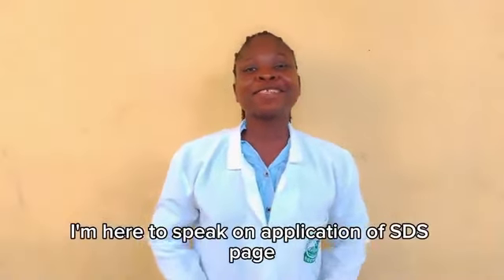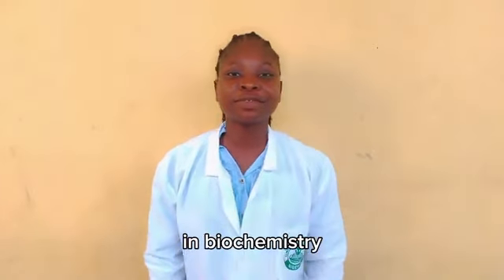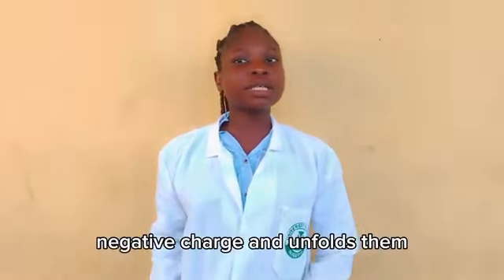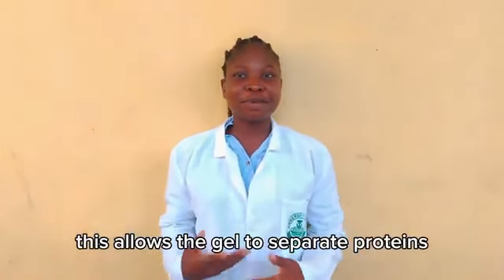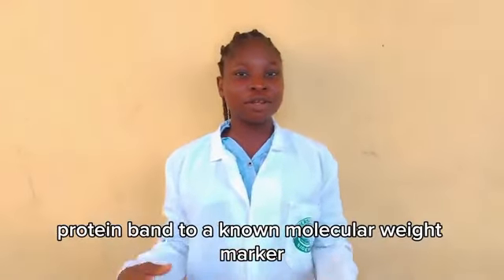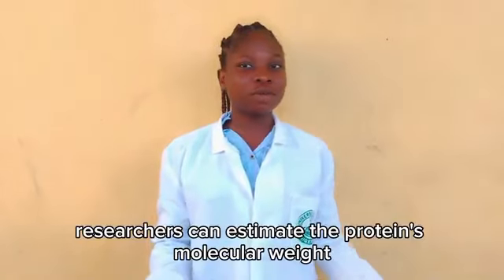Hello everyone, I'm here to speak on the application of SDS-PAGE in biochemistry. We have determination of protein molecular weight. Under that, SDS coats proteins with a uniform negative charge and unfolds them. This allows the gel to separate proteins only by their size. By comparing an unknown protein band to a known molecular weight marker, researchers can estimate the protein's molecular weight accurately.